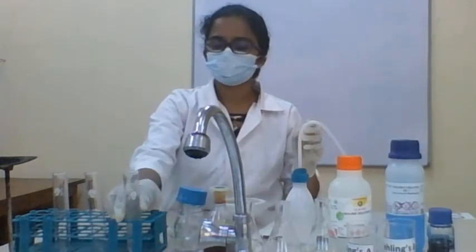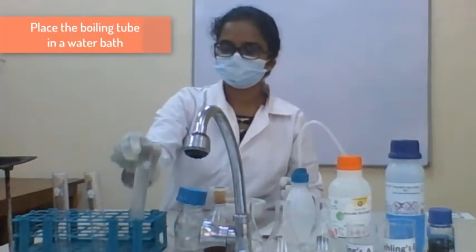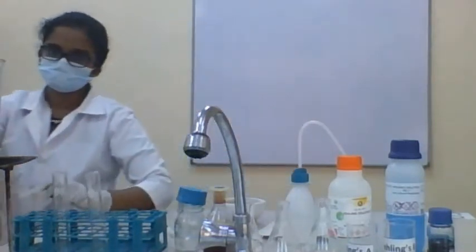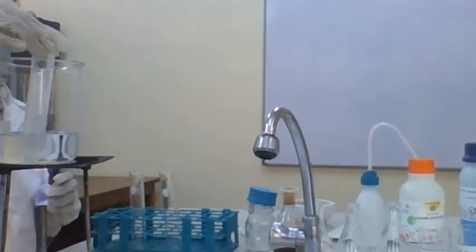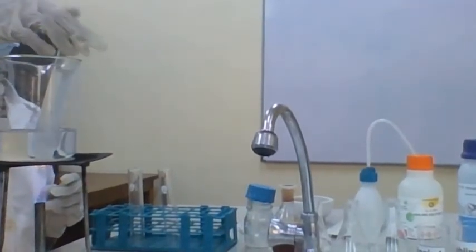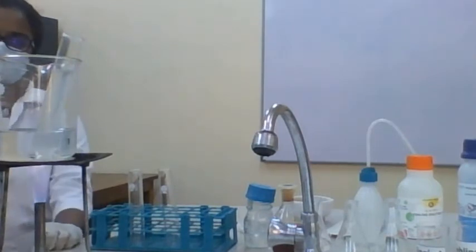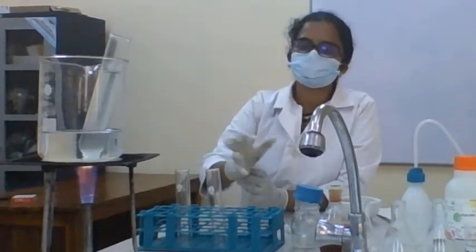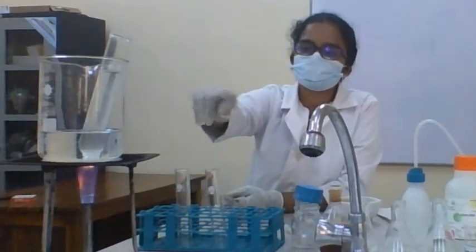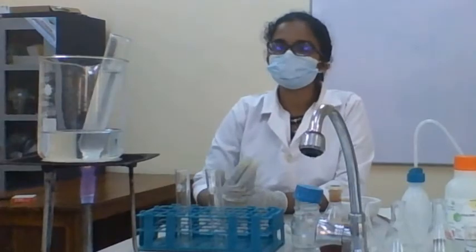And then I'm going to place this boiling tube in a water bath. And we are going to maintain this water bath until the end of our experiment. You have to note down the time at which we put this boiling tube into the water bath.